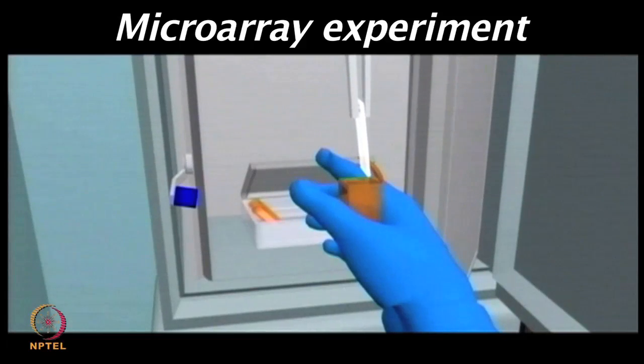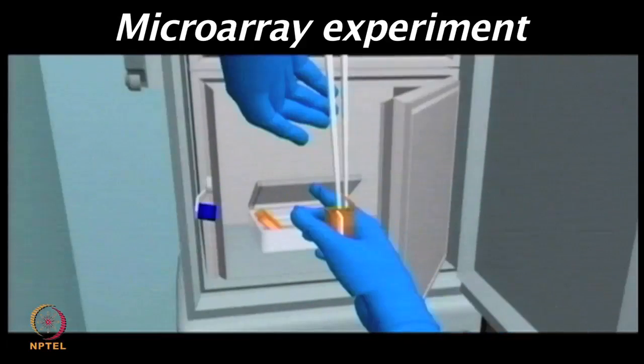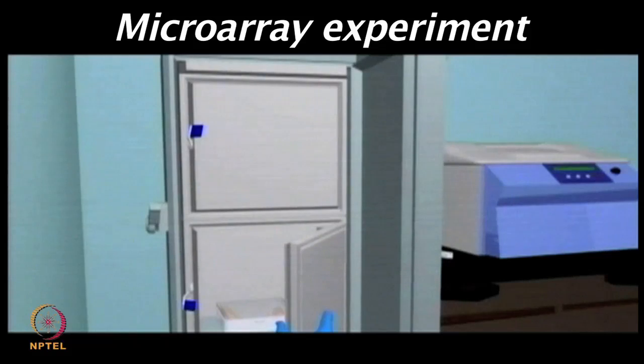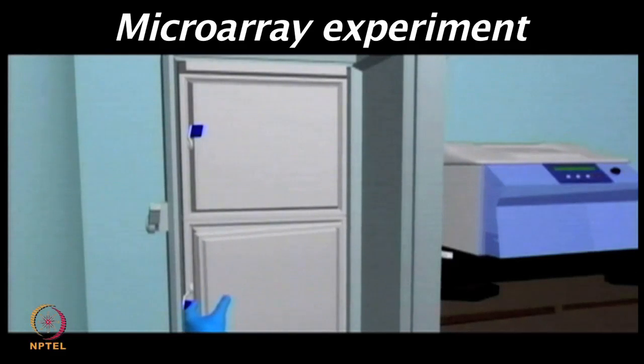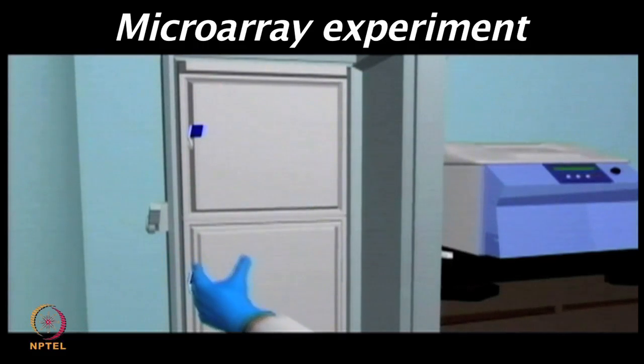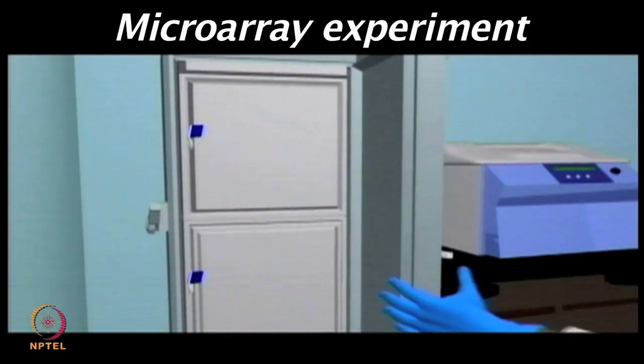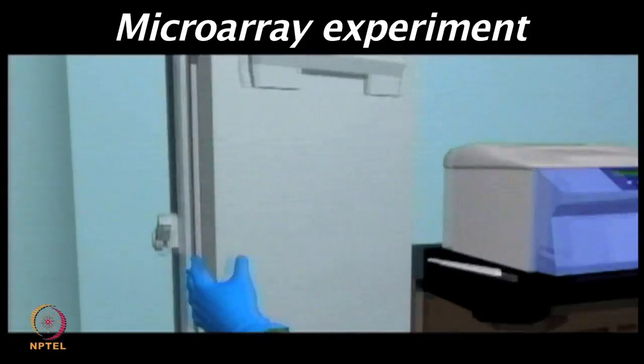In the cell based protein microarray system, the purified proteins are printed on the chip and those are stored at -80 degrees. As you can see in the 3D animation, the slides were very carefully removed from the -80 freezer. And now, one needs to thaw those slides very gently, so as to avoid any diffusion type of effect.